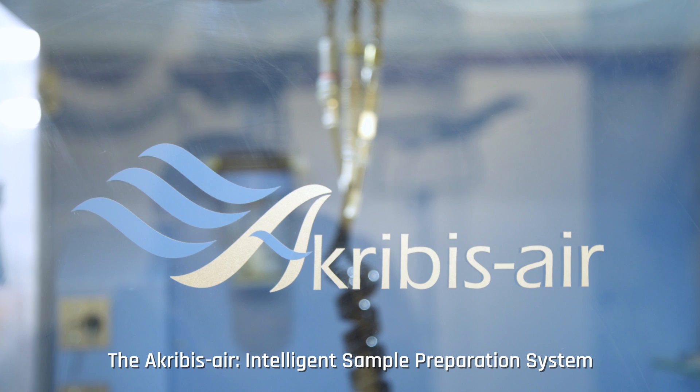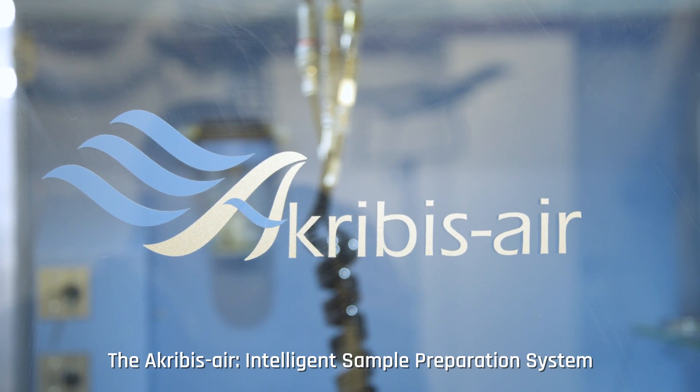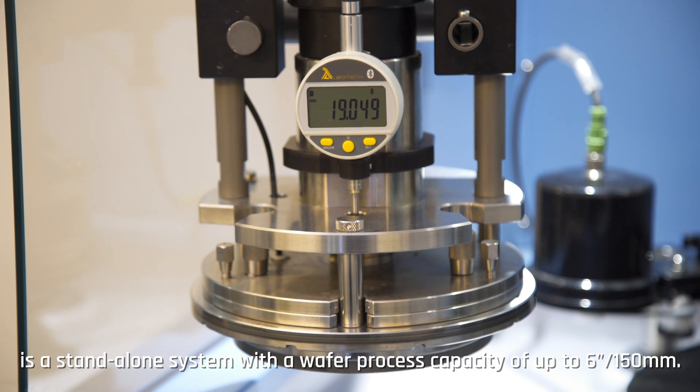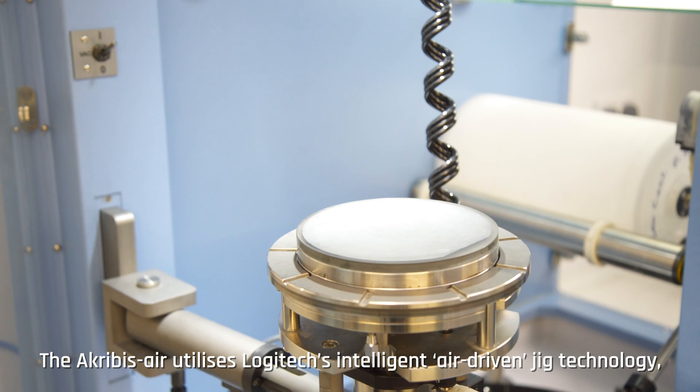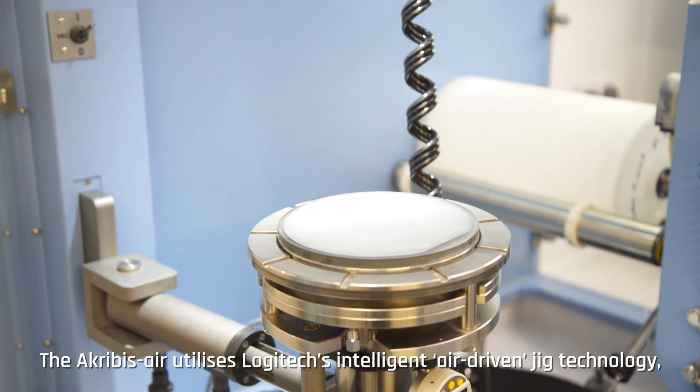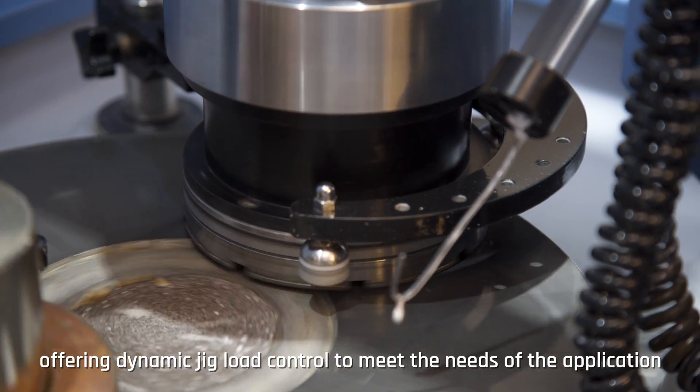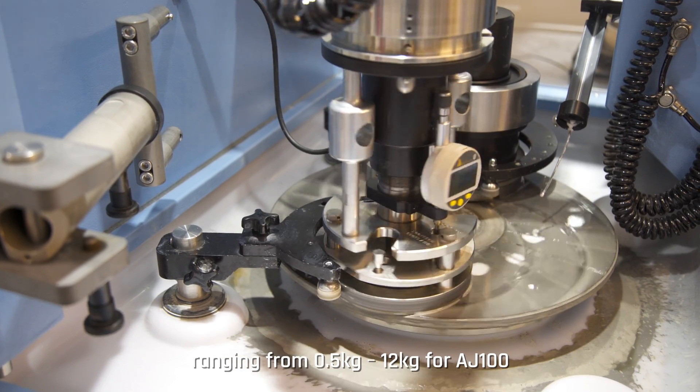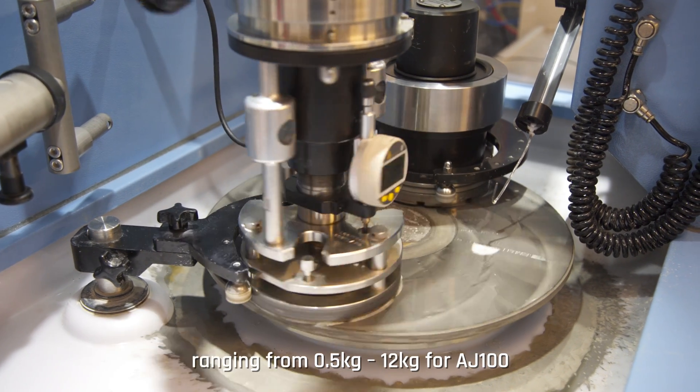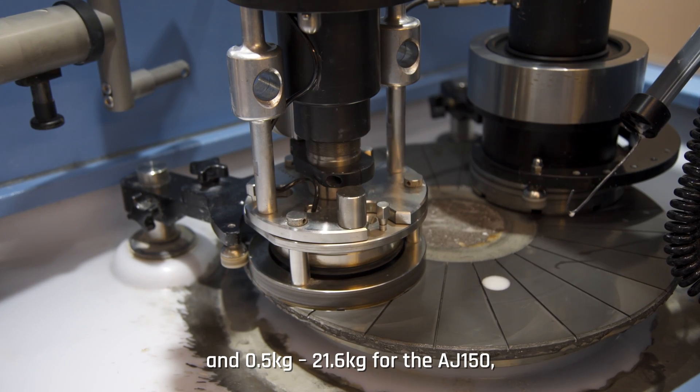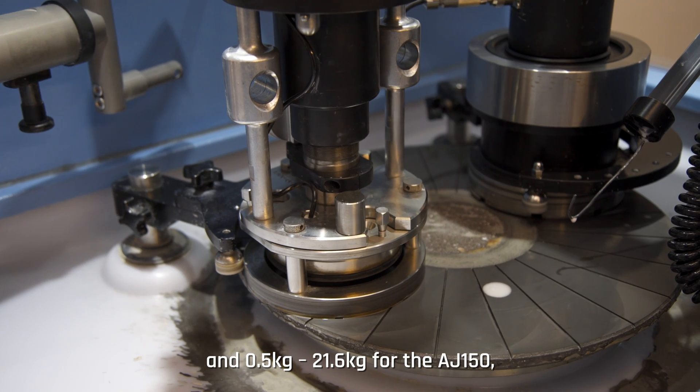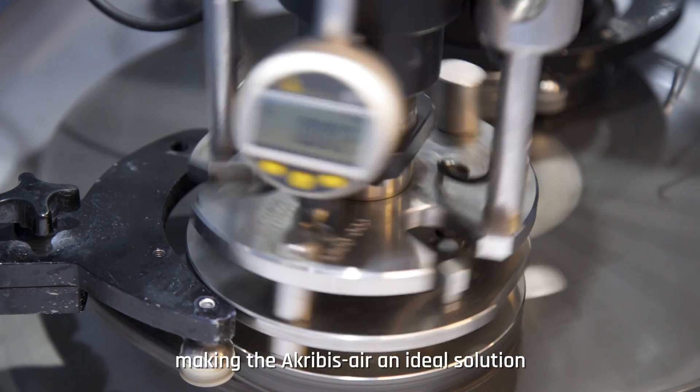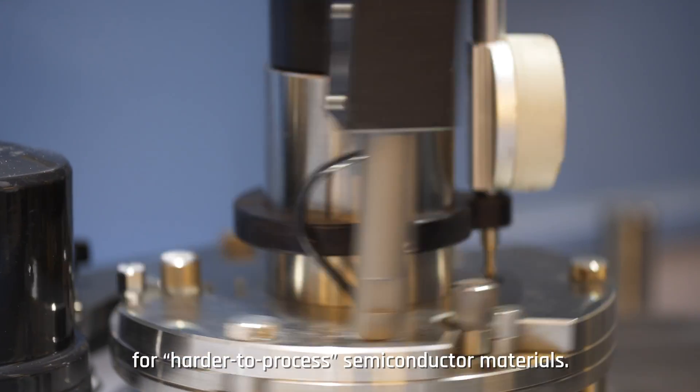The Akribis-air intelligent sample preparation system is a standalone system with a wafer process capacity of up to 150 millimeters. The Akribis-air utilizes Logitech's intelligent air driven jig technology, offering a dynamic jig load control to meet the needs of the application ranging from 0.5 kilograms to 12 kilograms for AJ100 and 0.5 kilograms to 21.6 kilograms for the AJ150, making the Akribis-air an ideal solution for harder to process semiconductor materials.